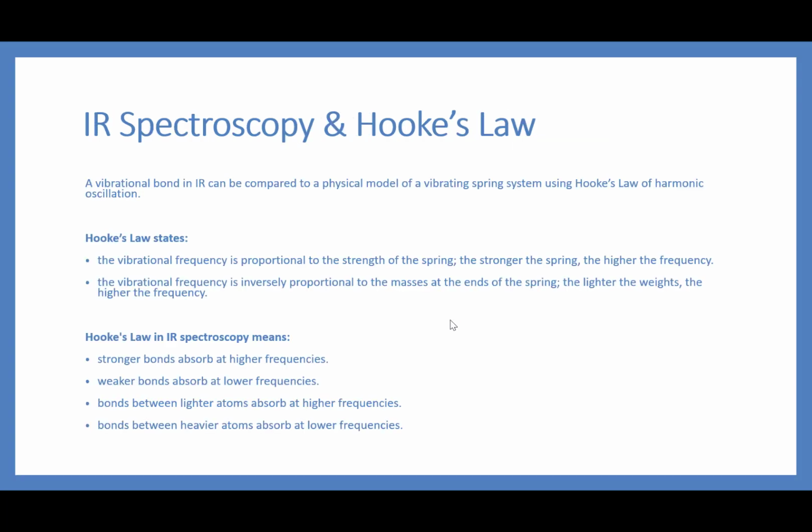And this is related to Hooke's law. Okay, so you may have heard this, you might get a flashback to junior cert maybe. So this is all related to your vibrating spring system, okay? So when we're talking about bonds within IR, they can be compared to a very physical model of a vibrating spring system. And Hooke's law basically states that the vibrational frequency is related to the strength of the spring. So the stronger the spring, the higher the frequency. You can also say that vibrational frequency is inversely proportional to the masses at the end of each spring. So the lighter the weight, the higher the frequency.